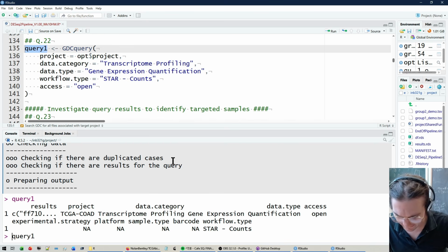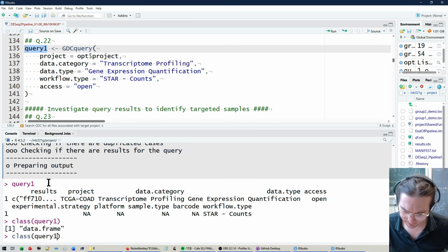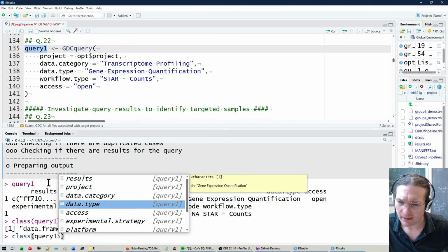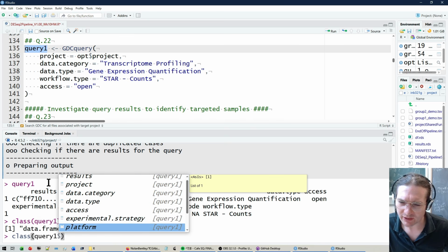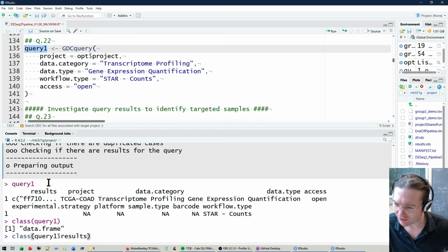If we try to investigate what it is, we could ask, what's the class of this object? It looks weird. It's a data frame, like a one-row data frame. That's weird. We could open up the $ sign and scroll through here, and really they're not all that interesting. Although one thing you may not know is that the AsIs class can store a lot of different stuff.